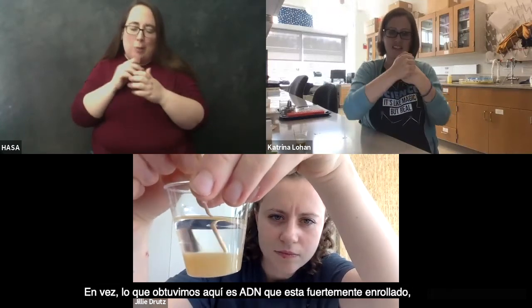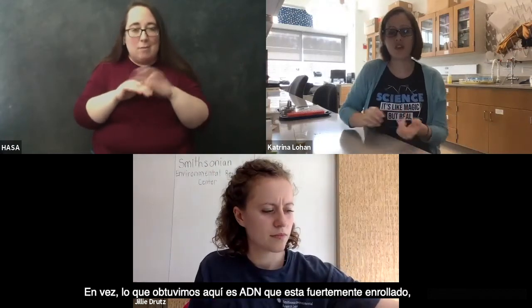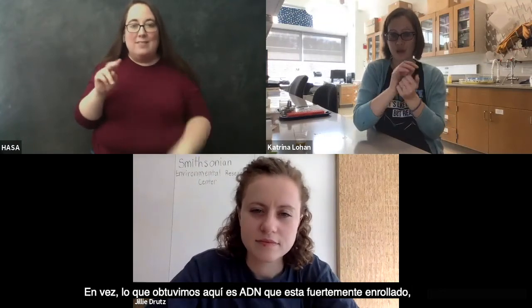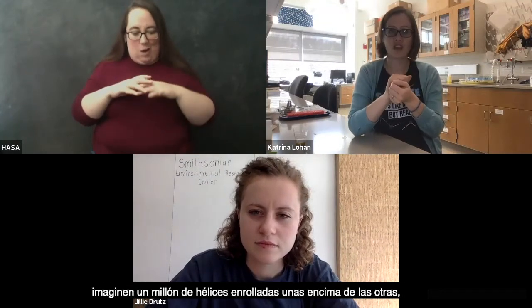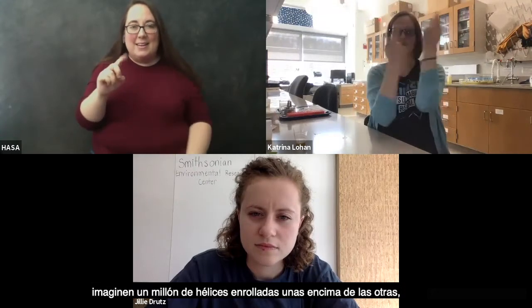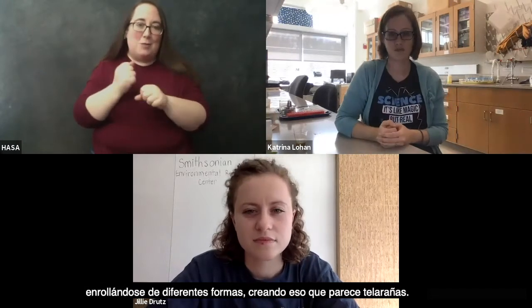There's a lot of tight-knit DNA, like on top of each other. And so what you end up with in an extraction like this is all of that DNA that comes out that's still kind of tightly wound together. So imagine like a million of those helixes combined and wrapped around in lots of different ways on top of each other that create those cobwebs. Wow.